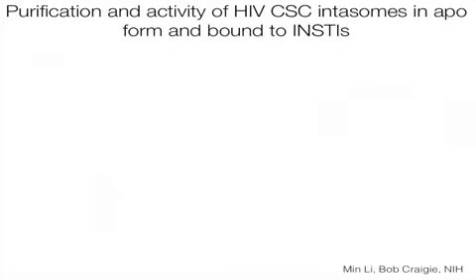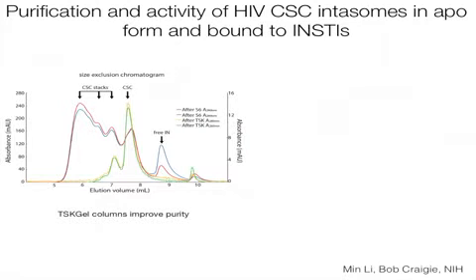So we can purify these assemblies. Just to briefly mention the purification scheme, we actually use 2 gel filtration steps. The first step uses a conventional Superose 6 column. And even though we get a single peak on the S6, actually the mixture is still quite heterogeneous.